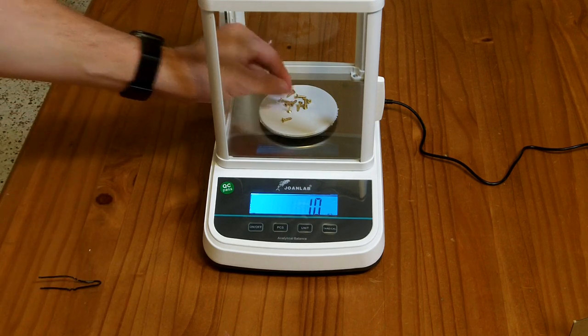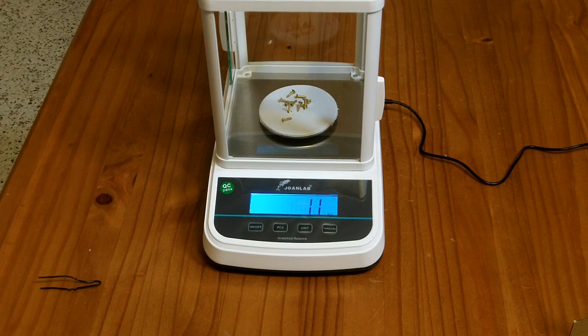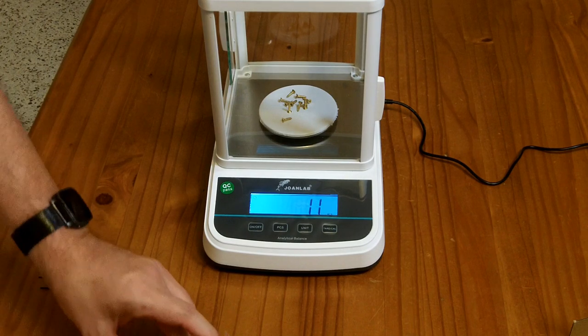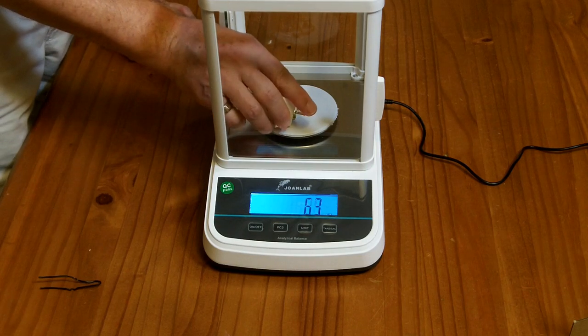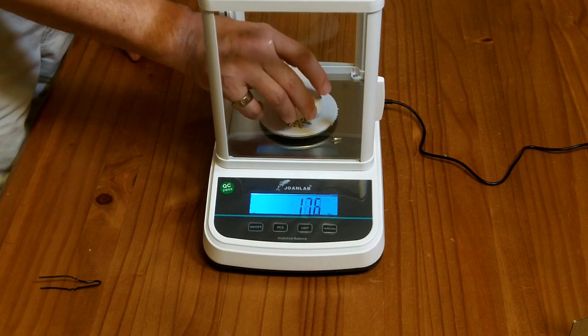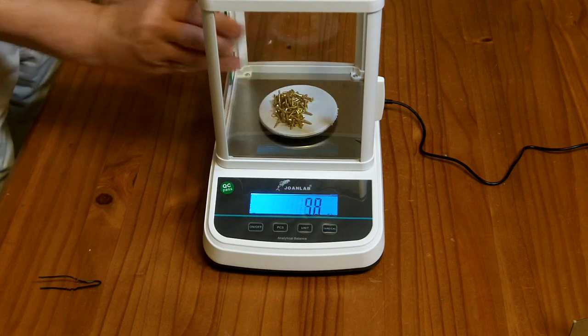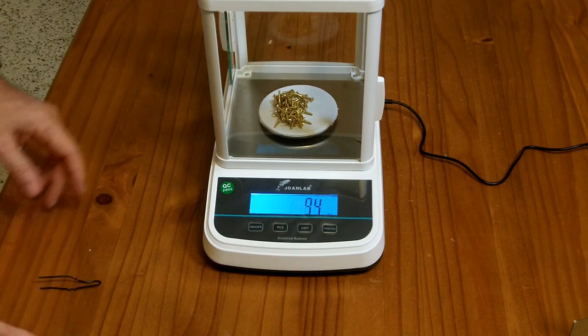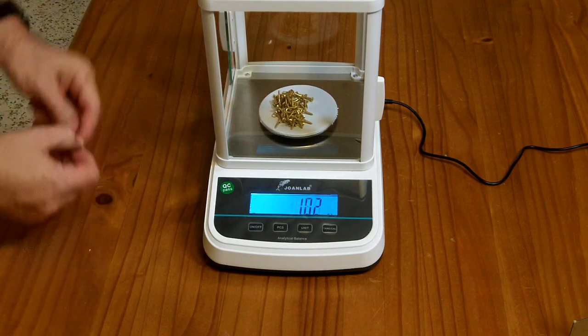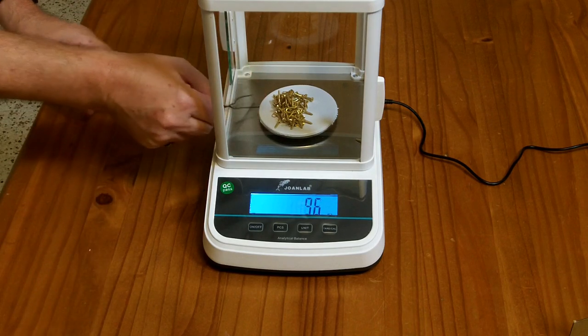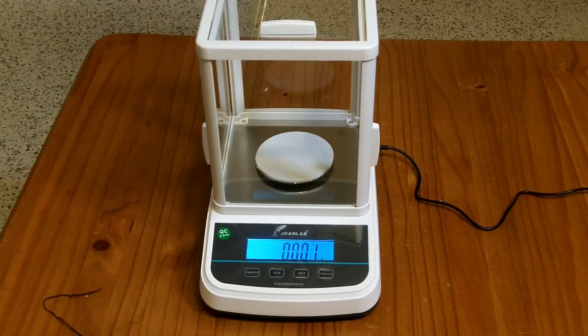So if I put another one, it says, oh, actually it's 11 now. And so if I were to take this whole box of screws and put them on the scale, there's like 94 there except for these two that I have dropped off the edge.